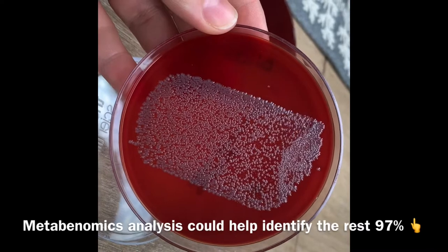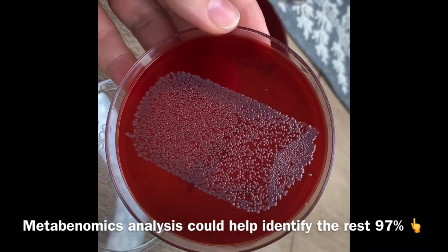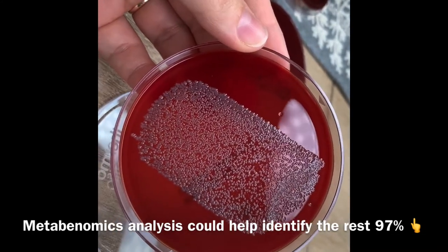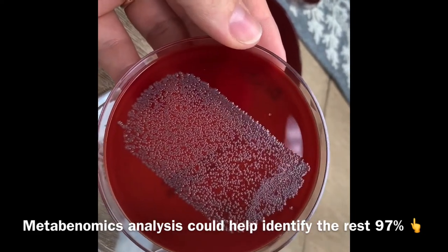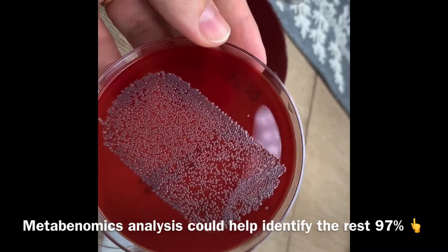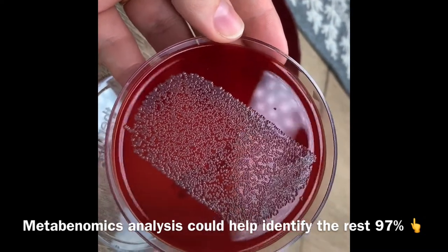That's why when we're studying microbiomes, different types of genetic methods are used right now. We're just extracting DNA, sequencing it, and then annotating and characterizing it, comparing to other databases to see what kind of bacteria are present.